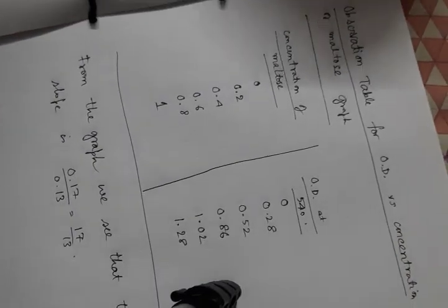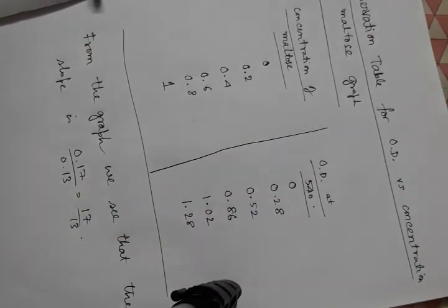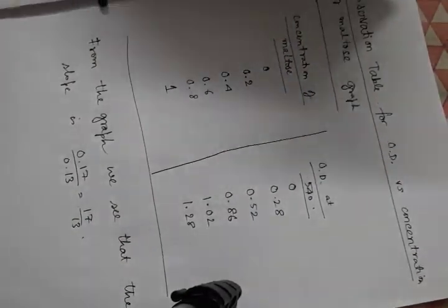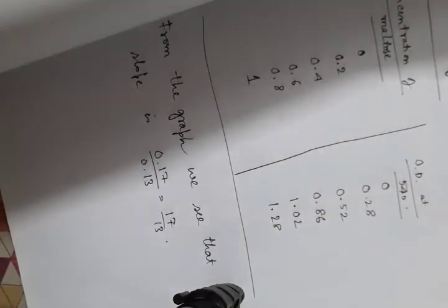Then here we have calculated the slope from the curve.